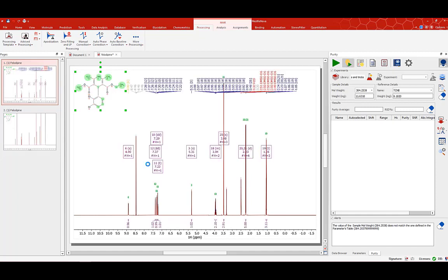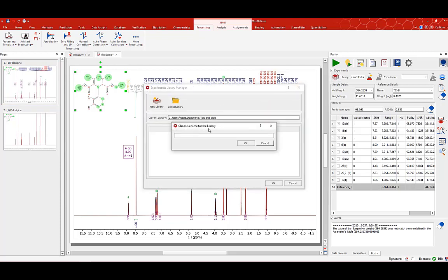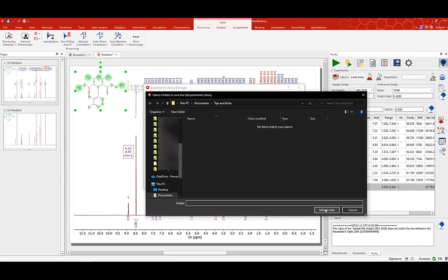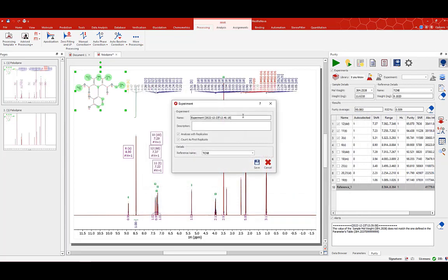But a lot of people are asking me: usually I do more than one experiment in QNMR — I do replicates. Can I do it with EMNOVA? Again it is very easy. I only need to create a new library. I'm creating a library of experiments, and then I create an experiment and this experiment will count my first spectrum as the first replicate and do an analysis with replicates.